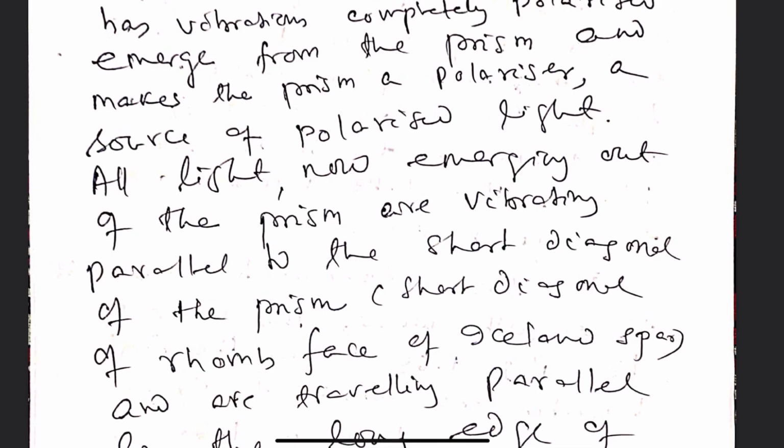When both polarizer and analyzer are used, they are said to be in such a condition that their vibration directions are mutually perpendicular, and that is called the crossed condition of the microscope, where the analysis of the polarized rays is made.